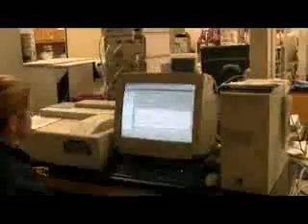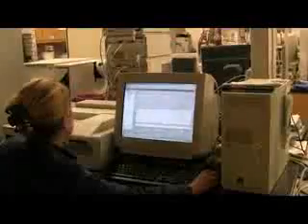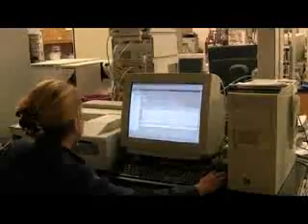The trick is that if you save 10 million thousand data points, you're going to have to save all those and you have to work with those big files. It's kind of annoying. And this is fine. This is perfectly good for what you need to do. Okay. So now we are all set here. Okay. So this is all of our settings.